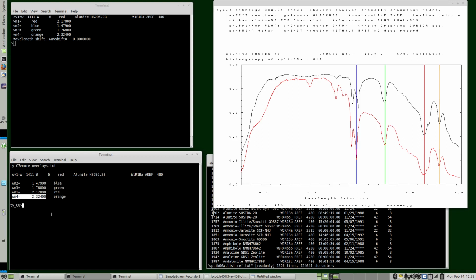One solution to that is to make that a comment. Then you can cut and paste those lines. Okay, but now we can see that the wavelengths here don't line up. For this feature, they do for this one and these. So that's a curiosity. It looks like these don't line up either. So let's just make a plot of these two that is better than the single pixel wide low resolution fonts.